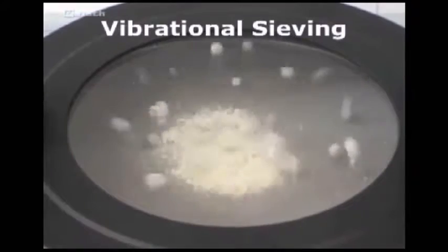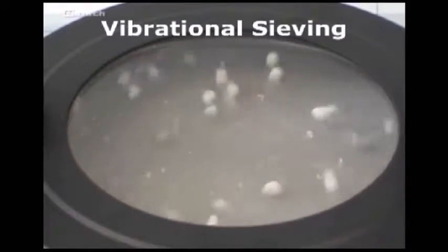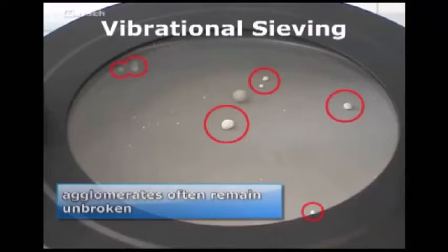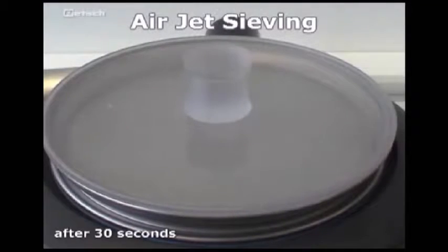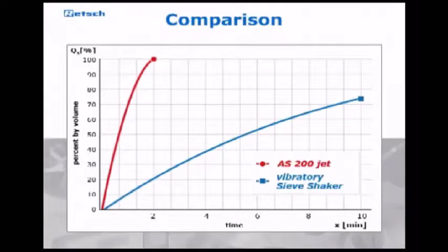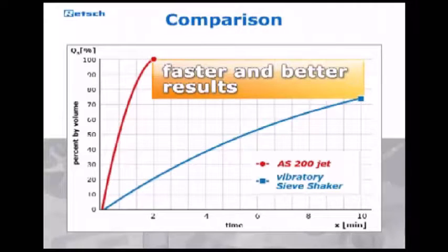Vibrational sieving of sensitive or very light sample materials with a tendency to agglomerate, which primarily applies to particles smaller than 200 microns, is very difficult. It is definitely problematic for particle sizes below 63 microns. In this size range, air-jet sieving is the perfect solution. Compared to vibratory sieve shakers, the AS200 jet provides for fine material sieving results with a higher degree of separation efficiency in only a fraction of the time.